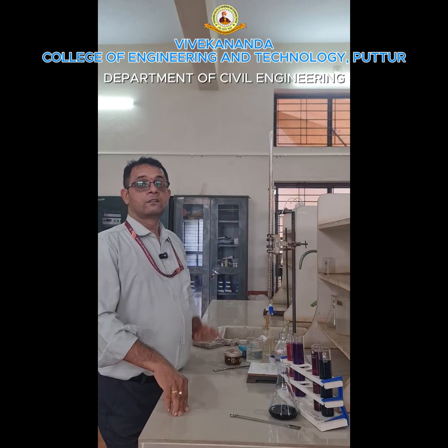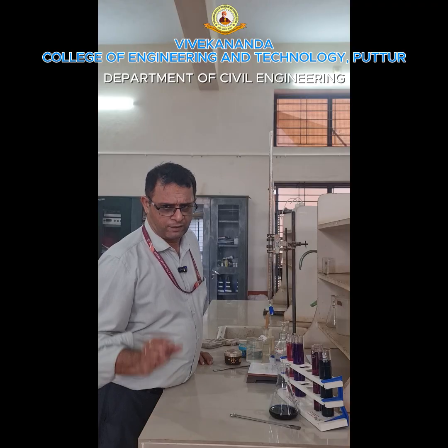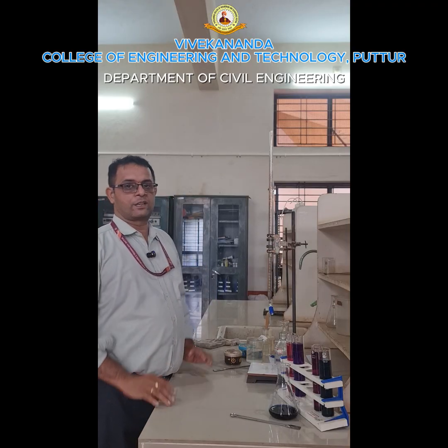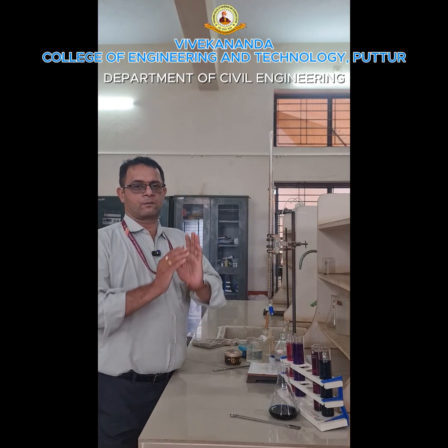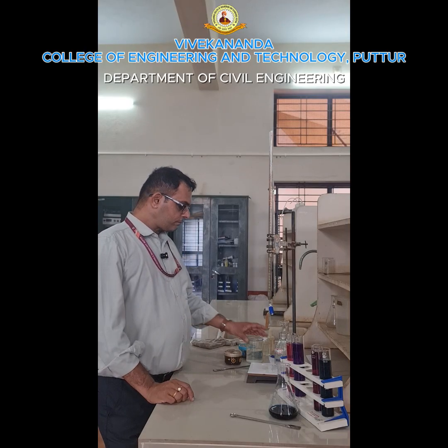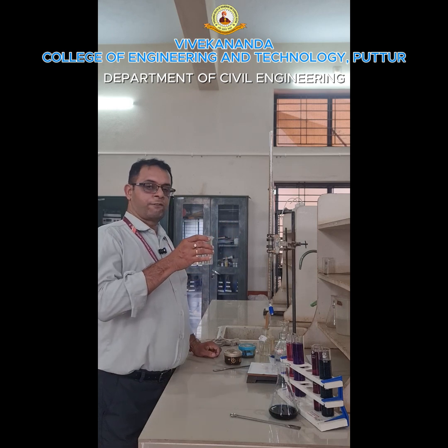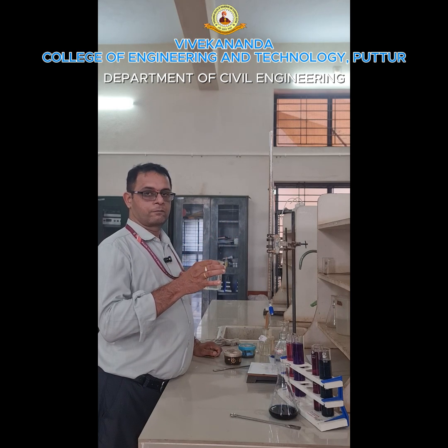Similarly, I have to do 3 trials. Then you substitute in the formula, and you will get the total hardness, which includes permanent hardness as well as temporary hardness.